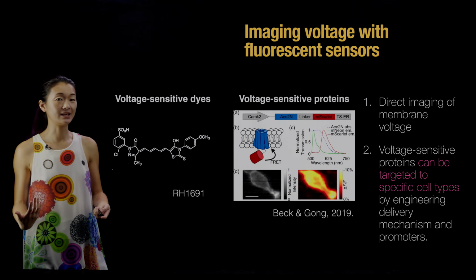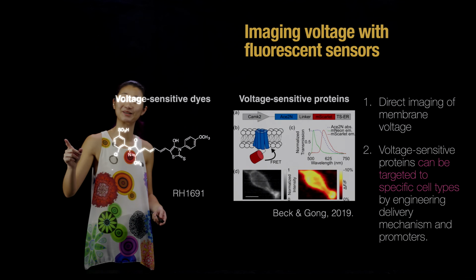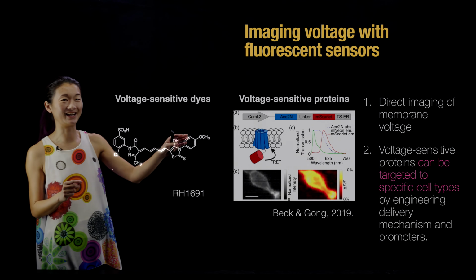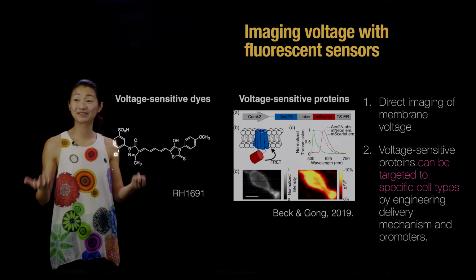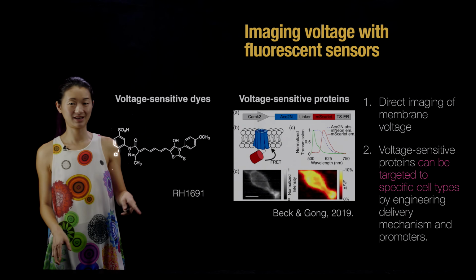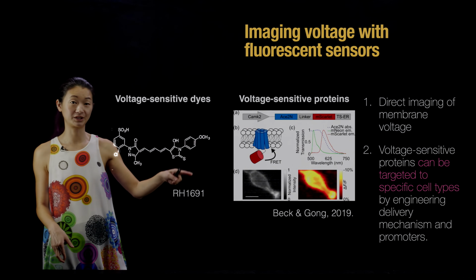And what we can do in the optical realm is a set of technologies. I got a little bit out of order here. I apologize. I'll get to the thing I'm talking about a little bit. First, one slide on voltage sensors. So we talked about calcium imaging, and that's really cool. And there do exist ways to image voltage directly with voltage-sensitive dyes and voltage-sensitive proteins.